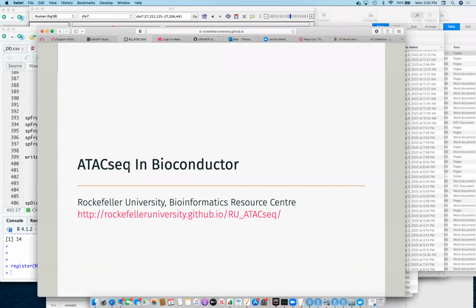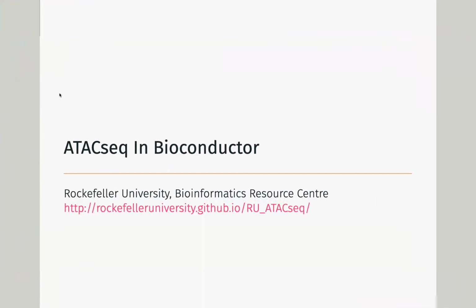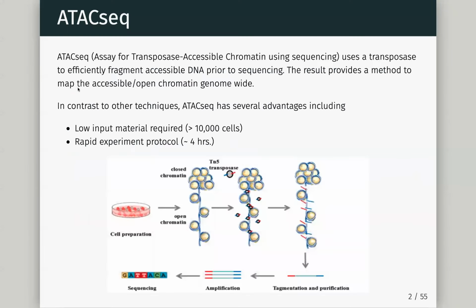Anyway, so I took a lot of the public data. I took the original ATAC-seq data, picked a little bit on Christina Leslie again, and we took some of her data again, just so that we can get a good idea what the original ATAC-seq looked like, what the modern day ATAC-seq looks like, and really dig down into low level looking at all these metrics. So that's what we're going to cover today. I've split it up into 4 or 3 sections.